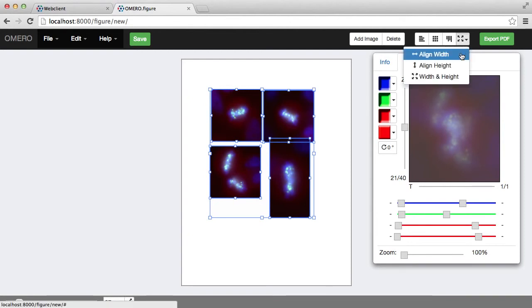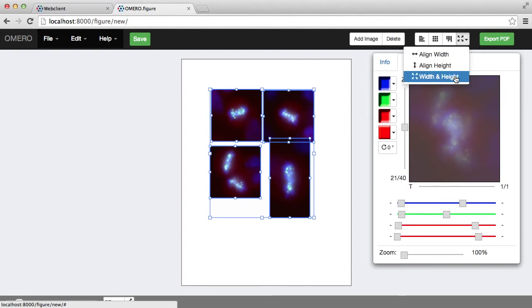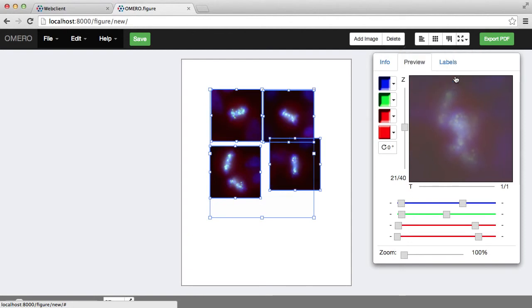I can align all the selected images to the same width or height, or in fact the same width and height.